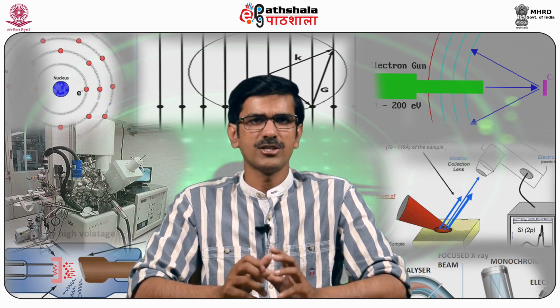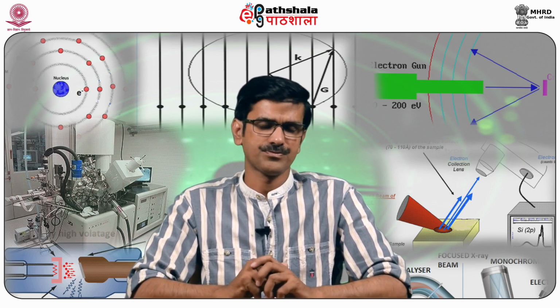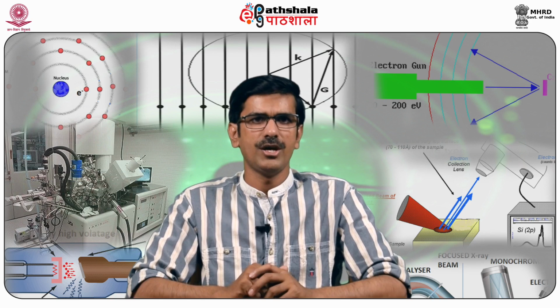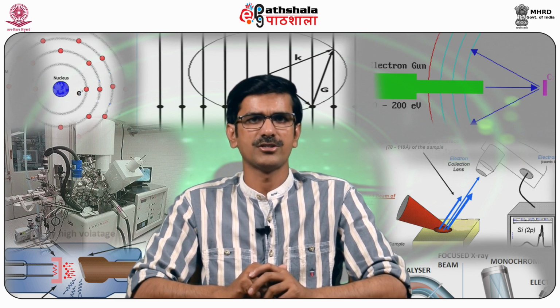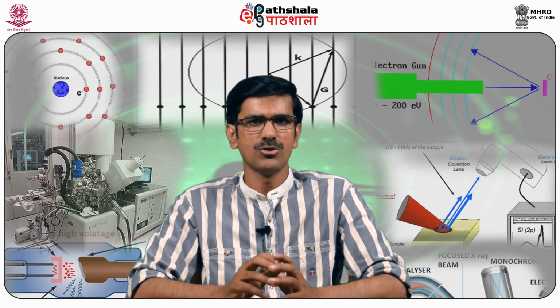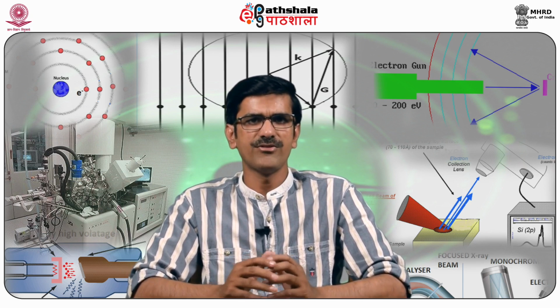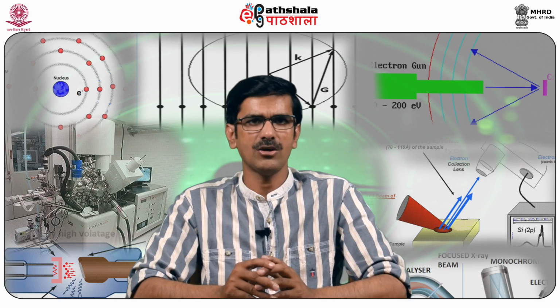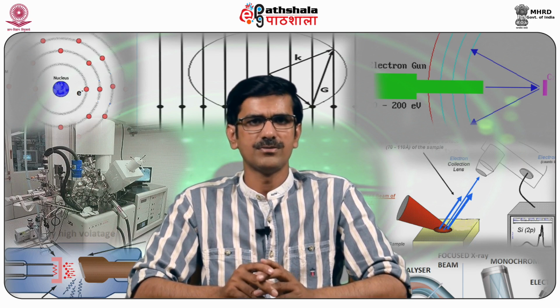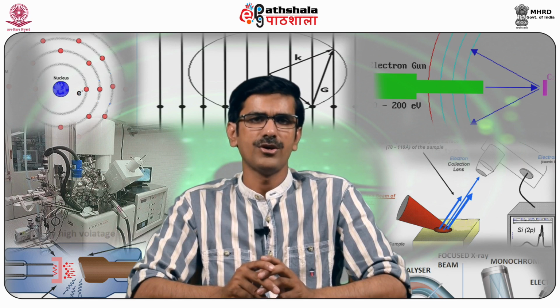Some specific examples of systems studied by XPS are: number 1, the analysis of stains and residues on surfaces. Number 2, reactive frictional wear of solid-solid reactions. Number 3, silicon oxynitride thickness and measurement of dosage. The 4th, depth profiling. In depth profiling, a sputter source is used. This removes successive layers from the surface of a sample and allows for the quantification of an element depth profile to be recorded in the near surface region. This is useful in the composition of thin films.